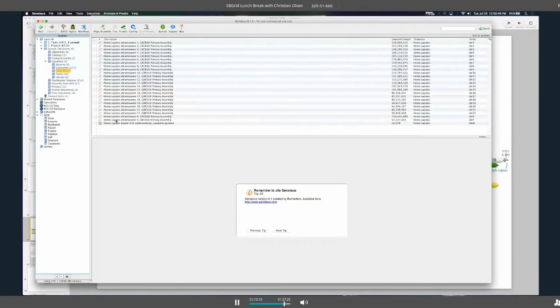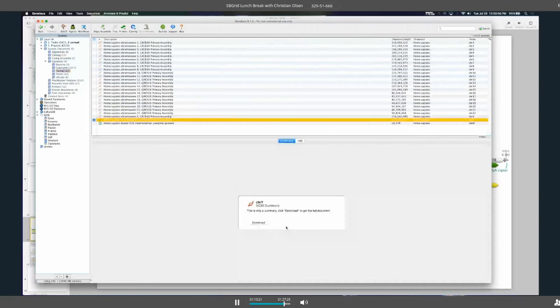So let me download just for demo purposes. This is just human chromosome Y. This is in my sample documents folder, which is found in every instance of Geneious. We have just the record for the sequence data. You'll have to actually go and download the sequence from NCBI.